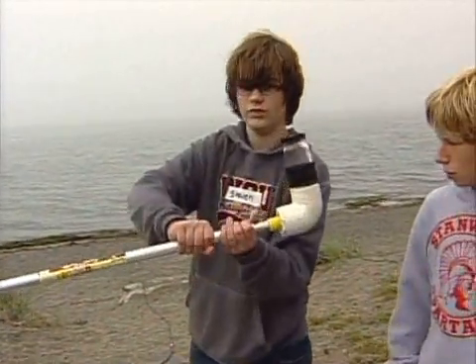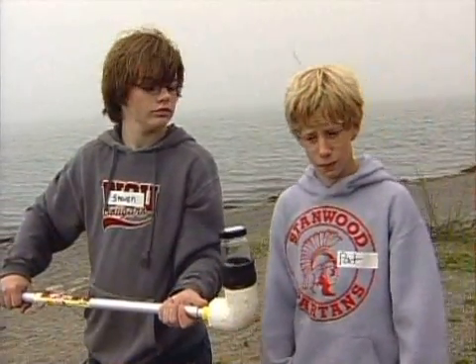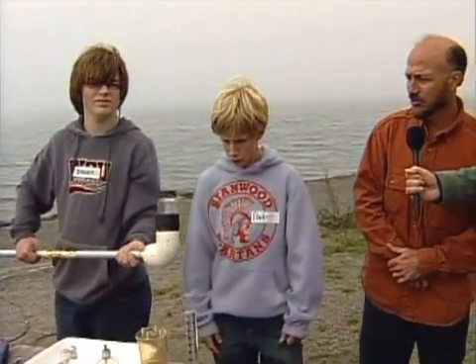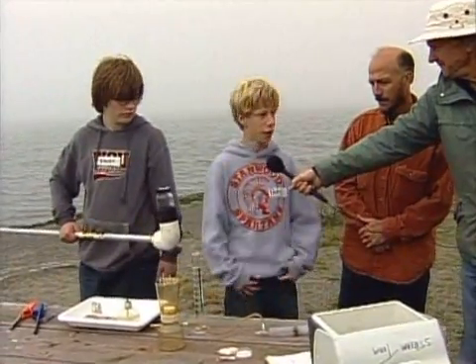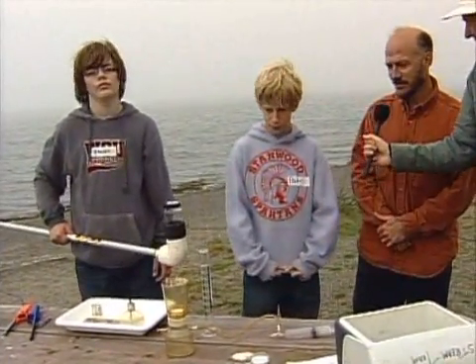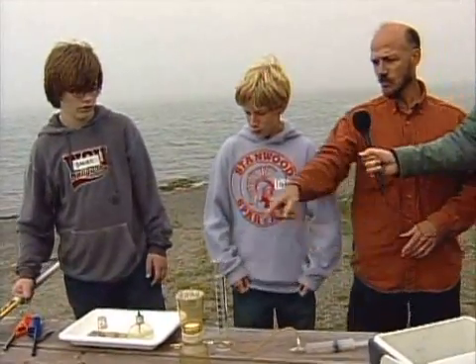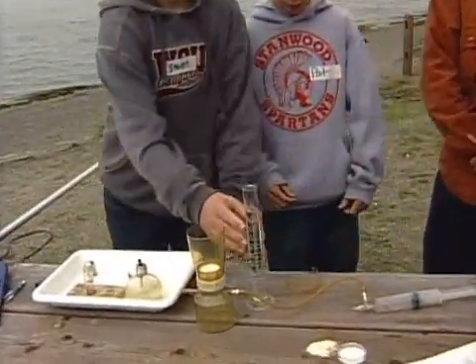Now the state standards and all around the country, they judge fecal coliform for how many are in 100 milliliters of water. So you guys, how did we get it into 100 milliliters of water? How do we figure that out? We poured it into a graduated cylinder. Right up to the 100 number. Excellent. Then what are we going to do next? Going to pour it into the jar. Yep. Steven said you're going to pour it.